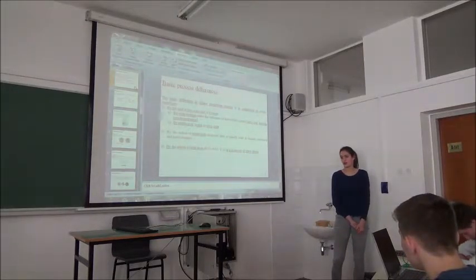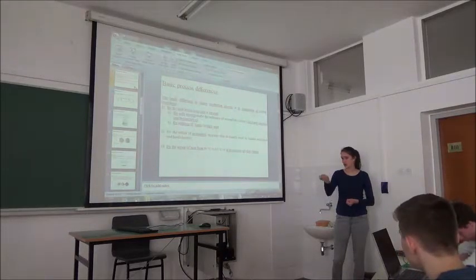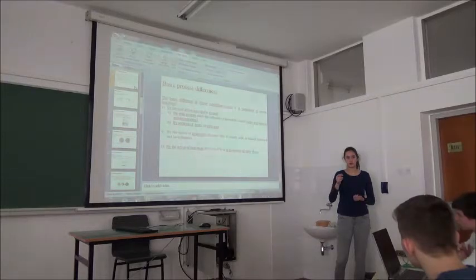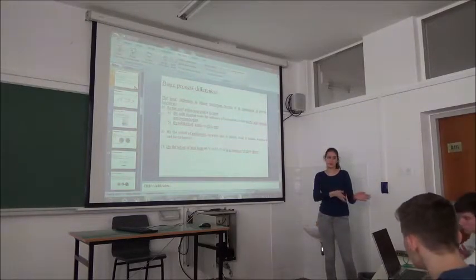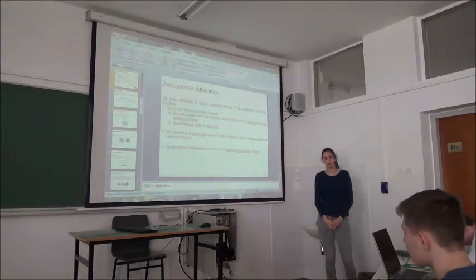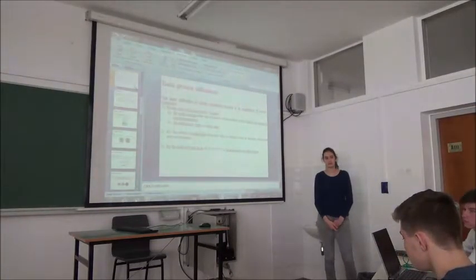I think I said it wrong. I thought when she asked me about measuring the pH in the cheese, that the pH meter has the thermometer on it or in it. So if the temperature was 22.6 degrees, later it was 23 degrees, but it was still the same result, the pH. That's what I meant. Okay. You just need to be clear when you're talking about that.